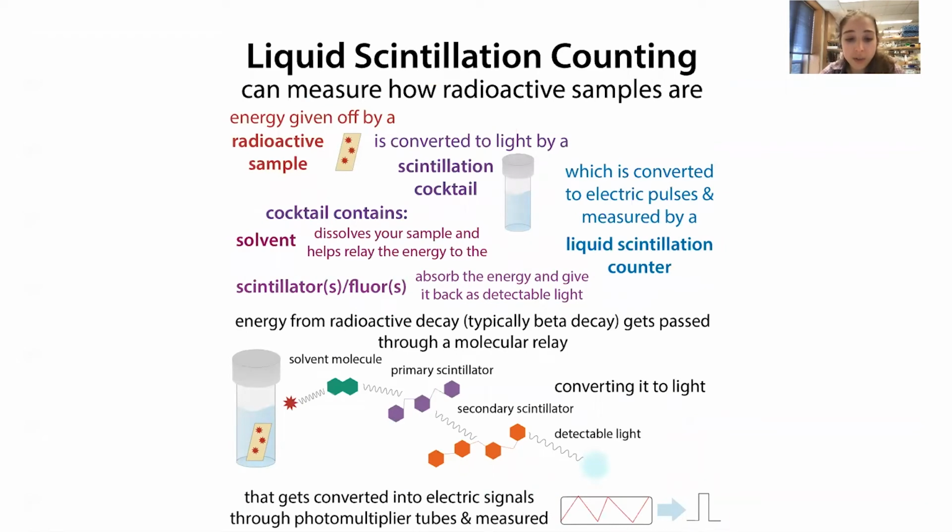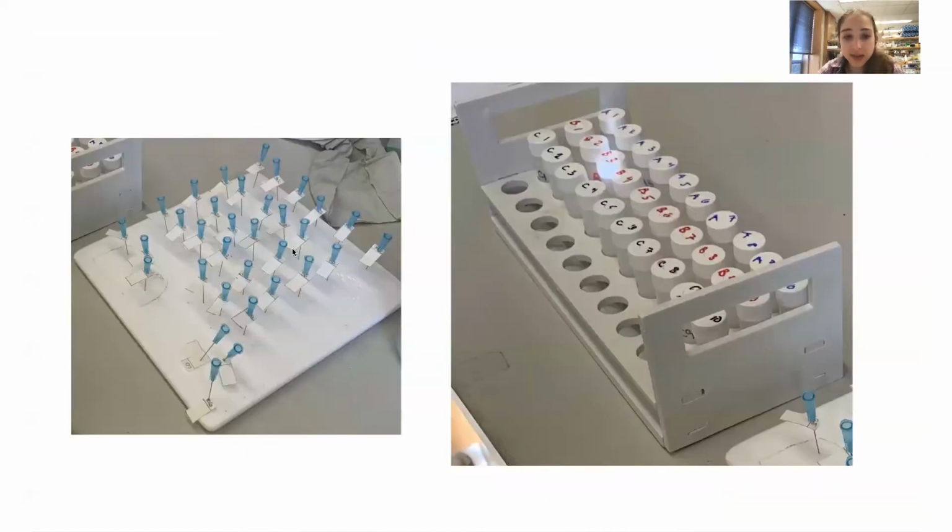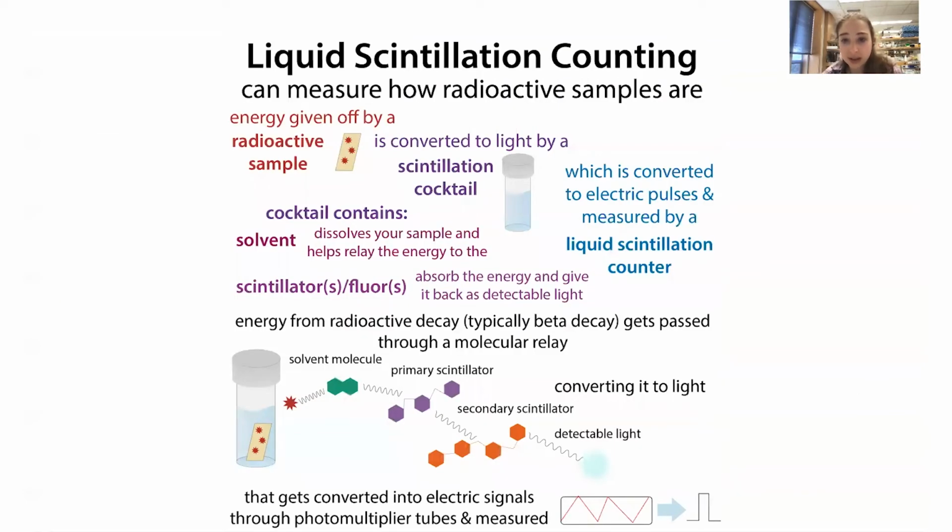In terms of what these actual molecules are inside of the scintillation cocktail, it's going to vary depending on what type of sample you start with. You can start with solid samples. When I do it, I start by spotting a liquid sample onto one of these filter papers and putting that in. You can also have little wipes that you put in if you do a surface wipe. There are various different ways. You can have a scraping from something, lots of different ways. And because those things you're putting in there will have different properties, you can use a scintillation cocktail that is better suited for it.